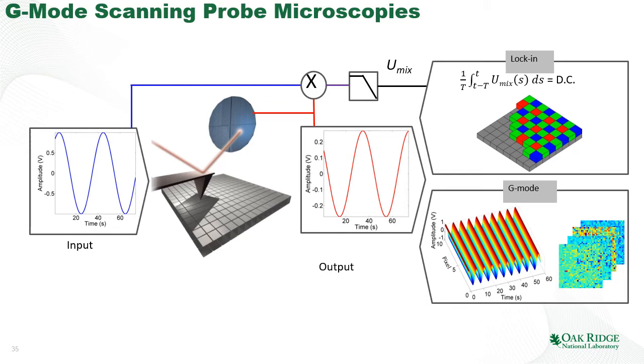In the very beginning of this lecture, I illustrated the application of the lock-in amplifier for detection in KPFM. The lock-in amplifier is used in the same way for all amplitude sensitive SPM techniques. Generally we apply some form of excitation, for example, a sine wave.